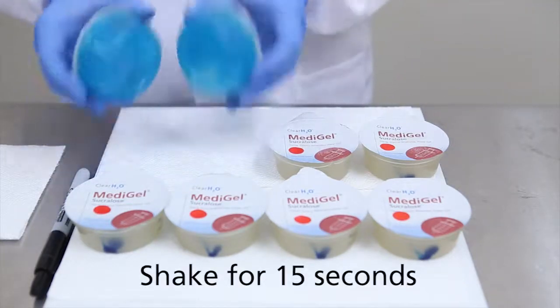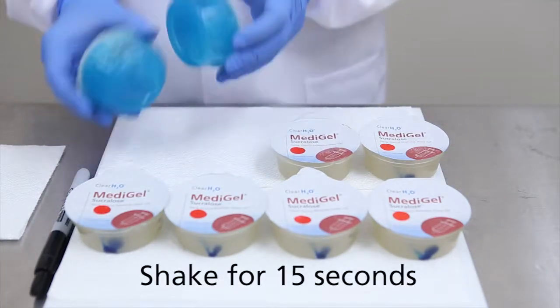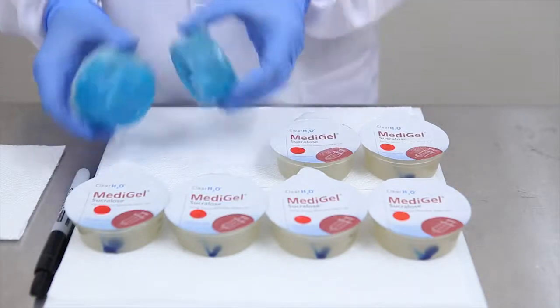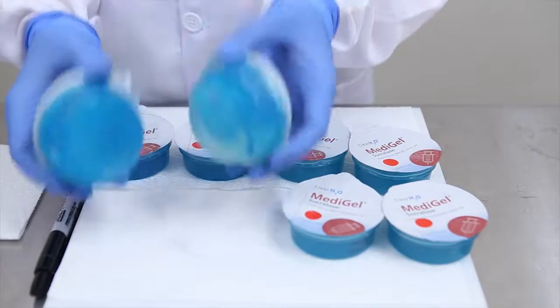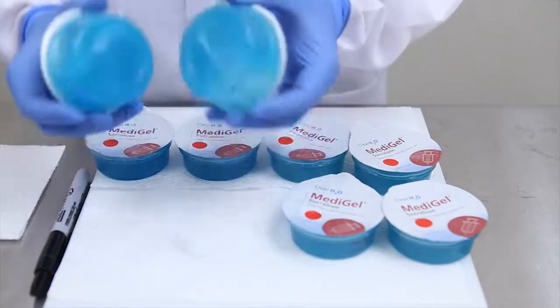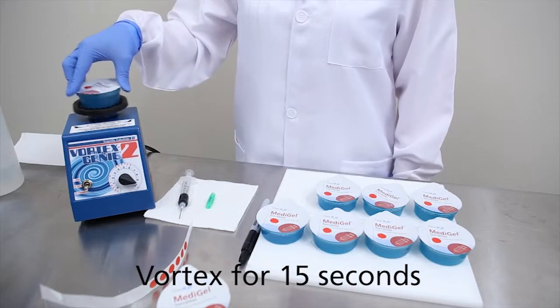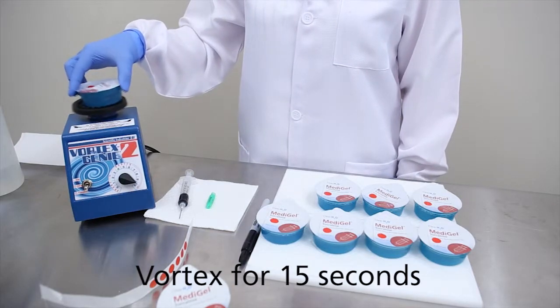The cups are now ready to be shaken by hand for a count of 15 seconds each. For ensuring thorough homogeneous mixing of the medication throughout the gel, vortex each cup for an additional count of 15 seconds.